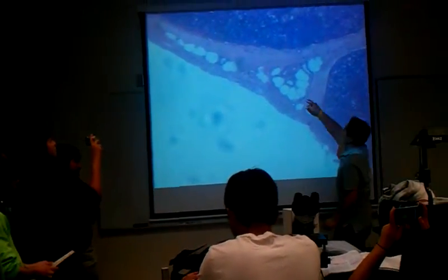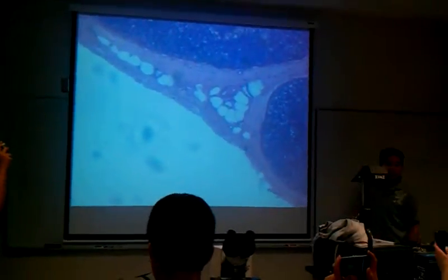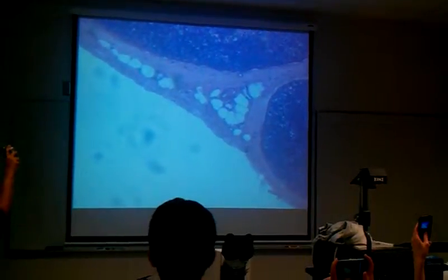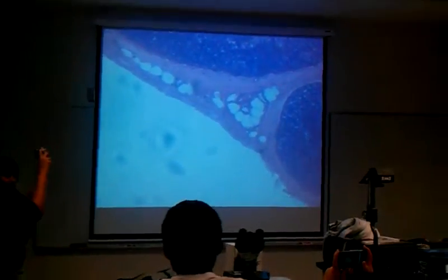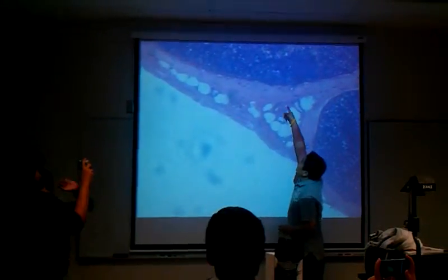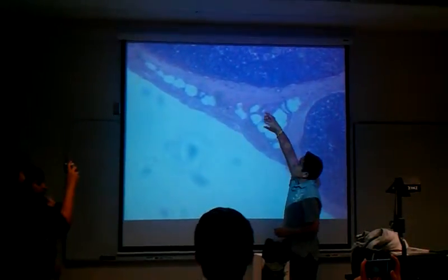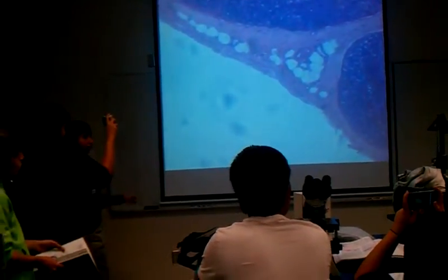What are these structures right here? They're kind of like this densely lined structure right there, that circle. Yeah, so those are the blood vessels. Can you point at it again? Right here, this circle right here. And when you look on the slide, it's a pretty thick membrane or line around the circle.